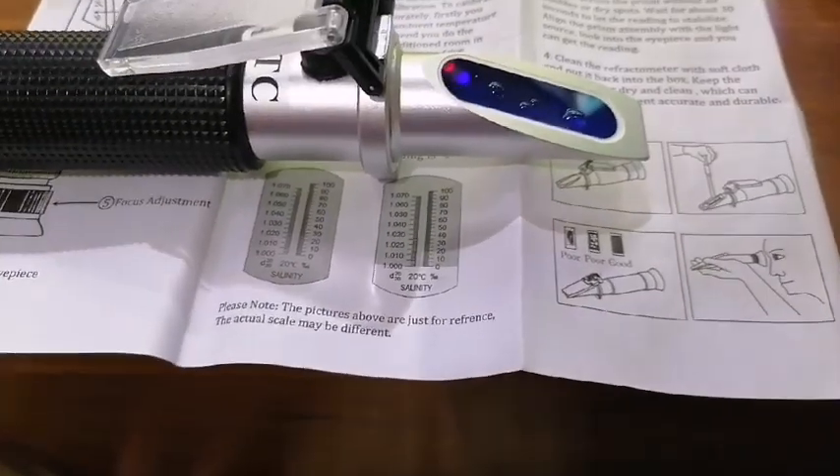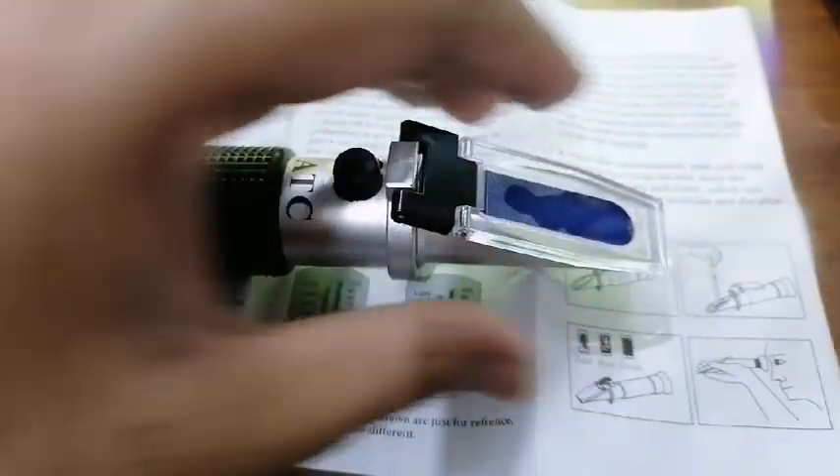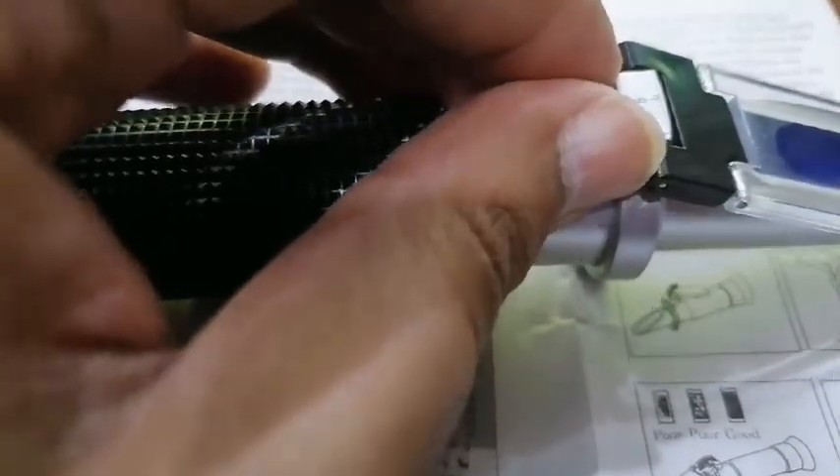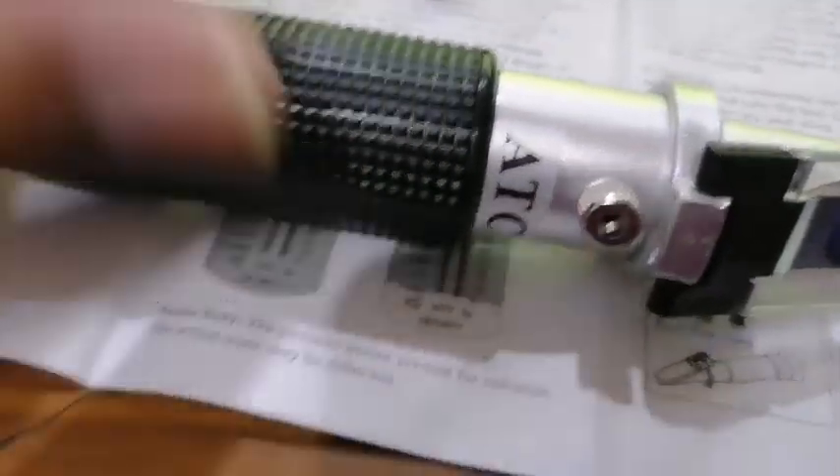You need to close the cover like this, and now look inside. Here you can see the salinity, which is around zero or 1.000, so it is already calibrated — as you can see, the white line is at zero and the upper portion is blue. If the white line is above or below zero, then you need to calibrate using the screwdriver. You need to remove the cover and use the screwdriver to adjust.